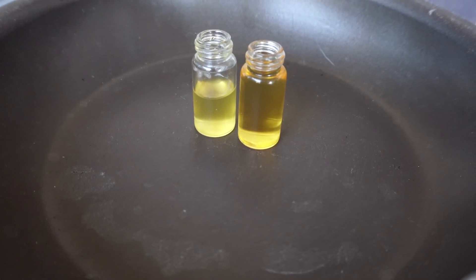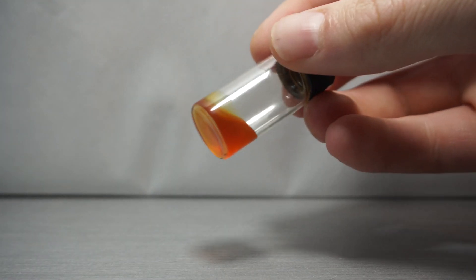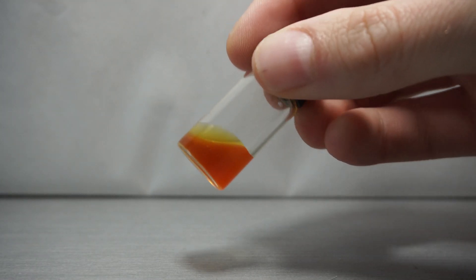From here, we slowly evaporate our ethanol off at around 150 degrees for 4 to 5 hours. Once done, we are left with an oily yellow cadaverine.